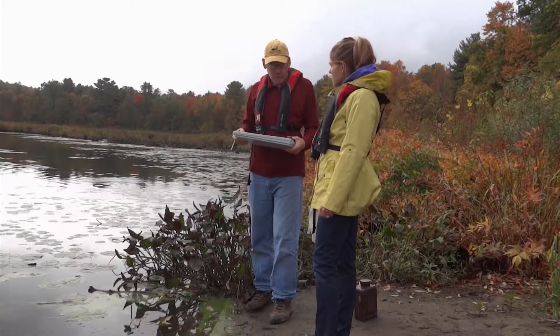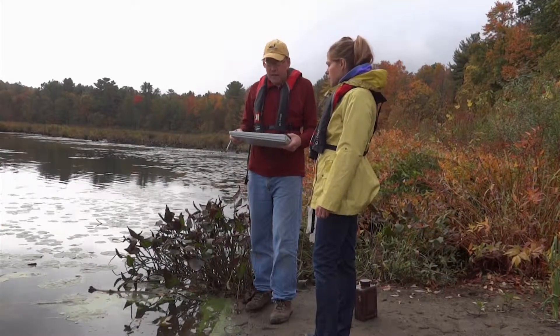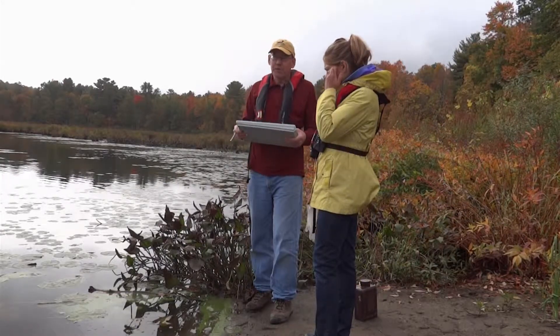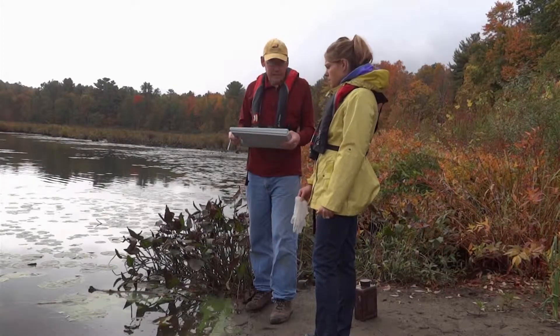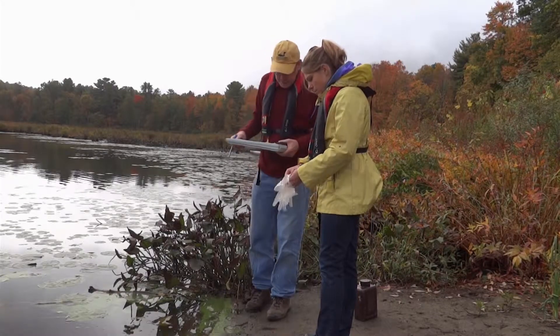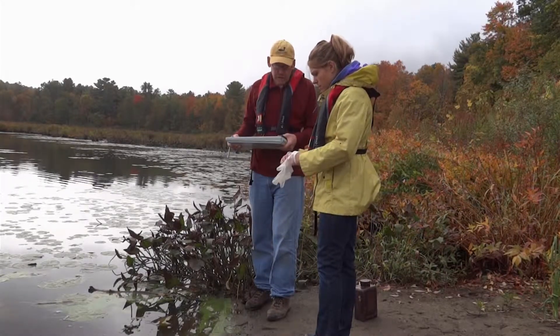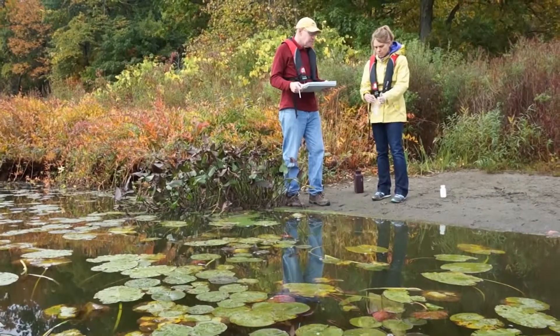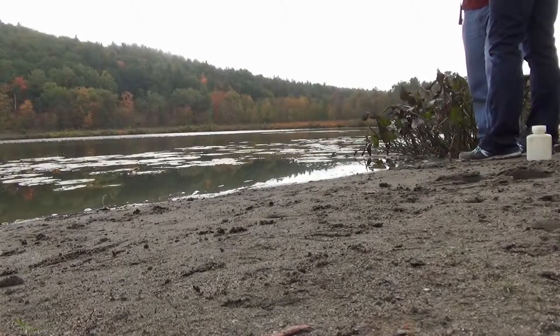I'm going to take you through the procedures for collecting an algae bloom sample and for filling out the paperwork. The first step in the process is to make sure that you are being as safe as possible when you're collecting that sample. We provided you with vinyl gloves in the sampling kit provided to all the C-SLAP volunteers. You'll start by putting on the vinyl gloves, and after you put the vinyl gloves on, you'll take the algae bloom bottle out.